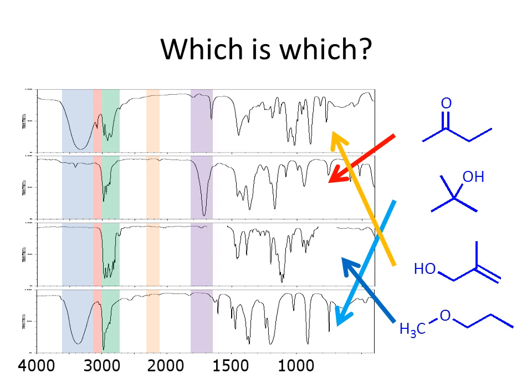Now, infrared tells us a little bit about the type of bonding in a molecule, but it only gets us so far. To get any further, we're going to need other techniques, like UV-Vis, mass spec, and the most important technique will be NMR spectroscopy.